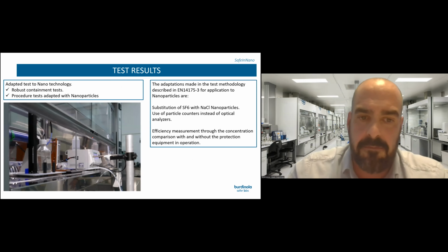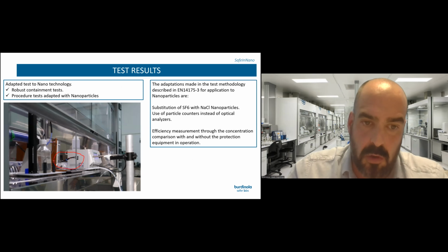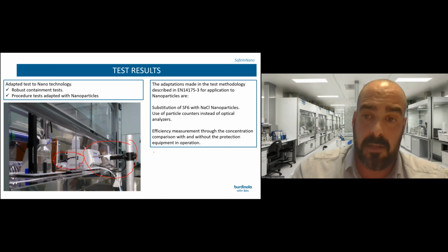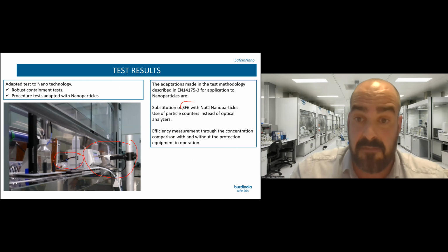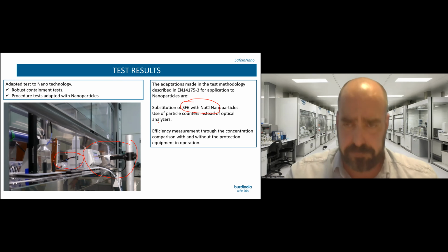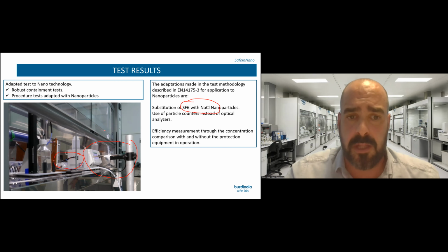So we have done the same. Here we have a particle injector. We are injecting particles inside the nanochamber, and outside we have a detector of nanoparticles. So we have replaced the SF6 with nanoparticles. So the results, which I think is the critical part.